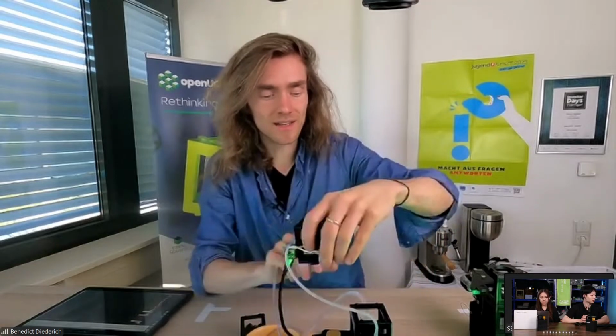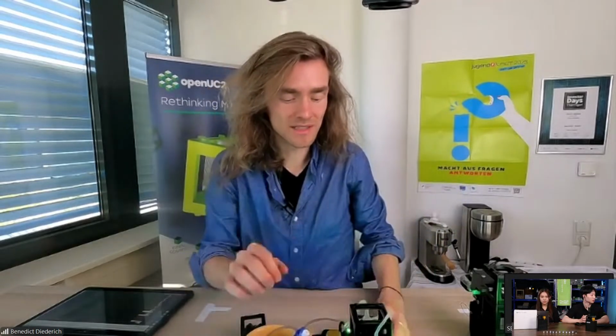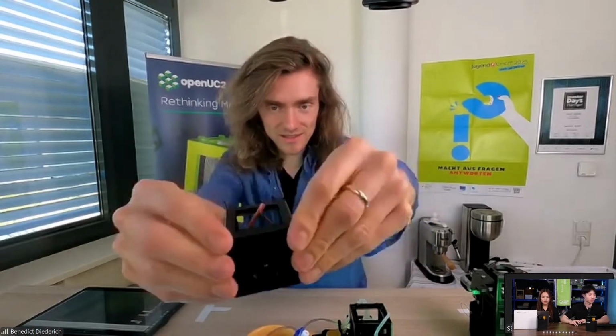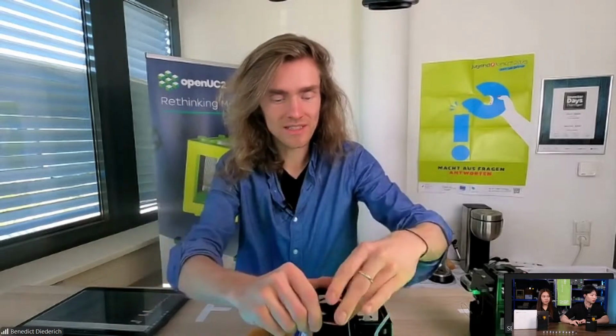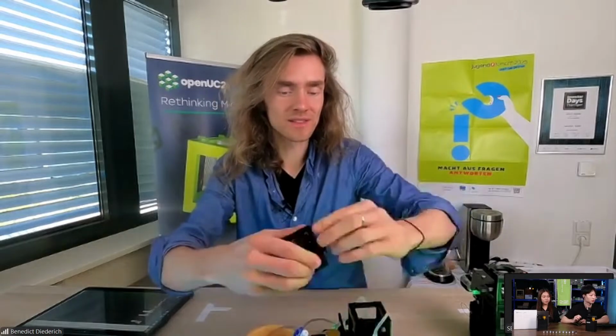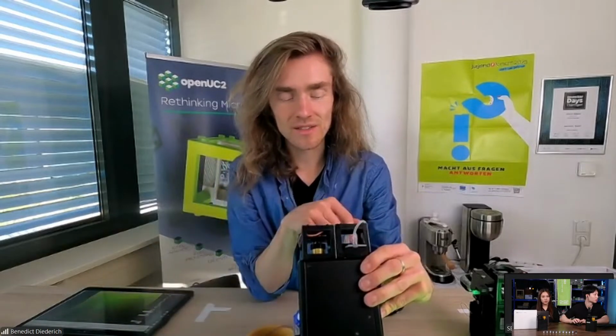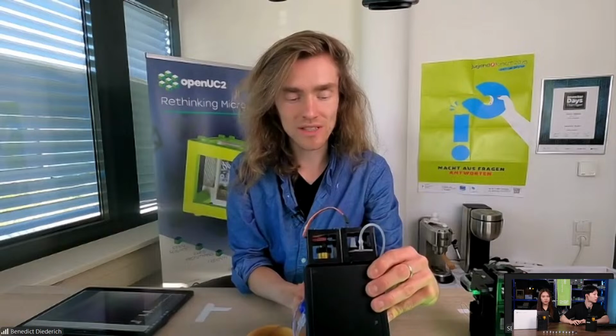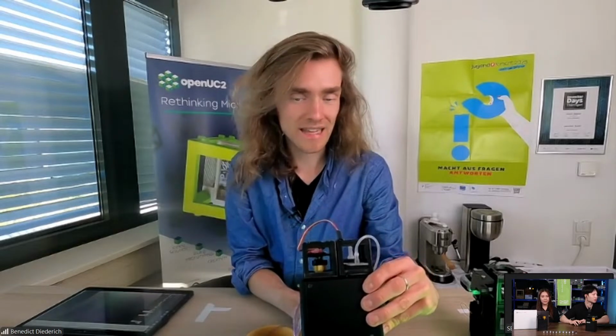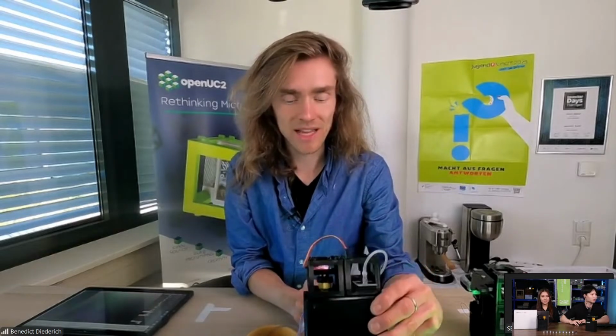And then, well, I'm removing this part here. You see that there's a little adapter on here, which is then in turn interacting with the focus knob. Oh, maybe the cable is not in the right place. So then you have a motorized focus here. You see the servo connects to the board, and then you can have a motorized focus. For example, if you have shaky hands or something, this becomes very handy.